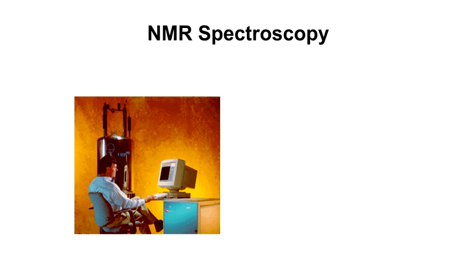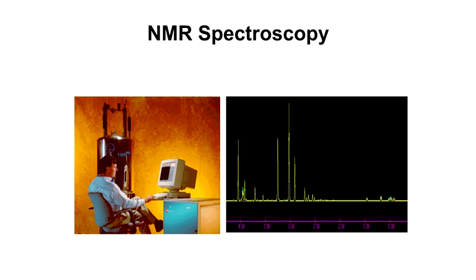and radio frequency electronics. And typically what you're doing is you're collecting a spectrum that looks not unlike the spectrum we saw for HPLC and GC. There's just lots of peaks. The peaks are not separated by time. They're separated by frequency. And these represent the resonant frequencies at which nuclei are, if you want, oscillating or vibrating.